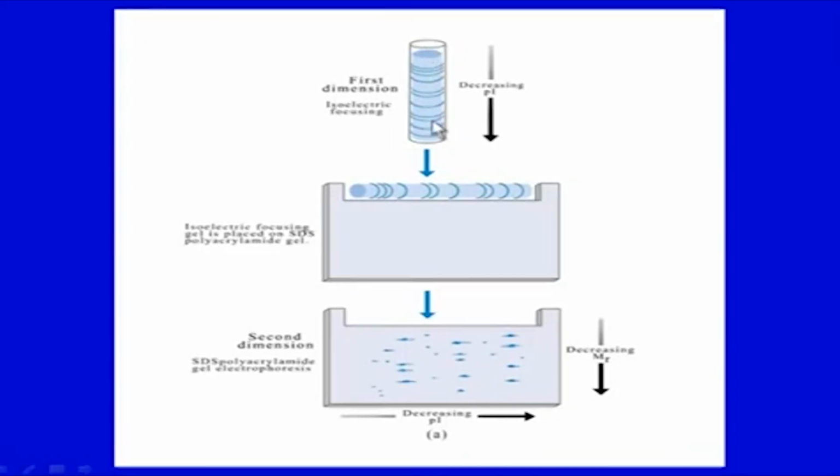So, if you can see in this figure, first isoelectric focusing has been performed, and you can see various bands of proteins after staining. If you do not want to stain, that is also all right, but this way you can see that it is doing well. Then you will lay this gel and it will run. Now, you have run in this direction, and now it will run at 90 degrees to the previous run on a stacking gel.